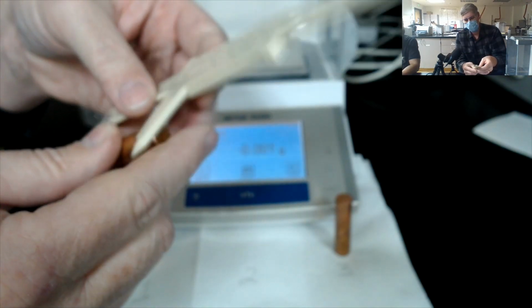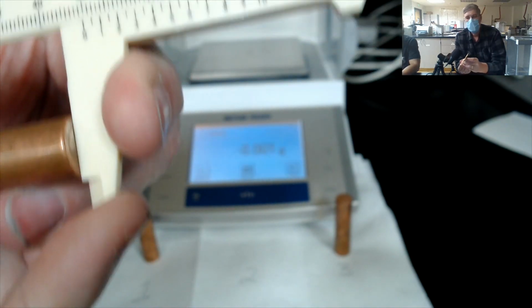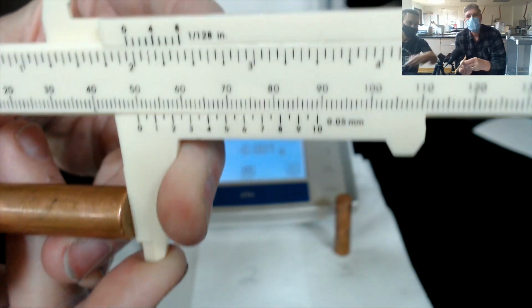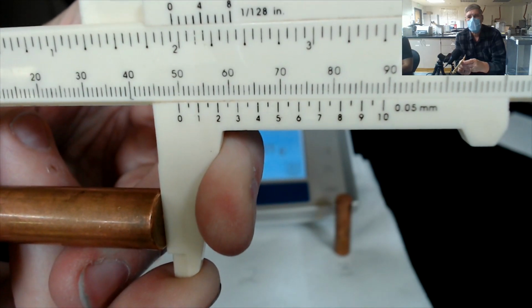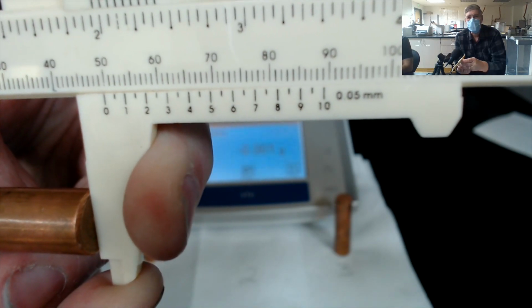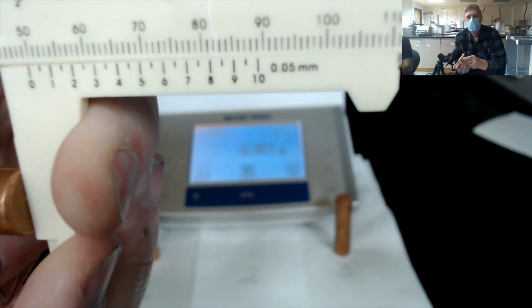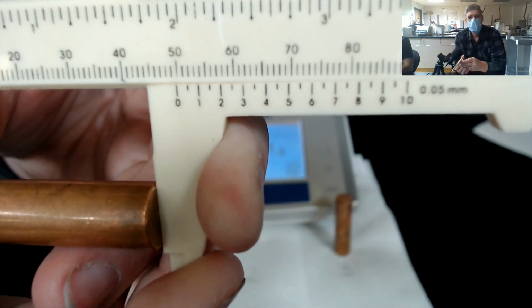Let's now do the length. Okay. Clamp the length. We examine where the 0 line lands first. Everybody. Alright. Everybody see the 0 line? Okay, now let's carefully find which of these lines lines up the best. Alright. Everyone, that should be your measurement for cylinder number 2.